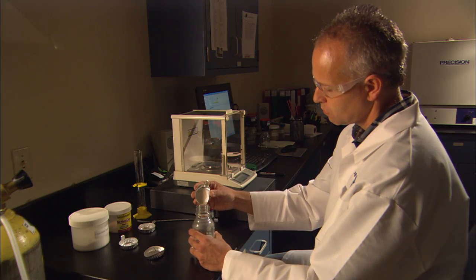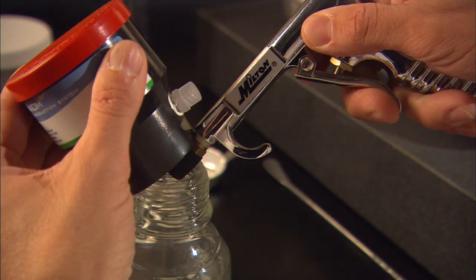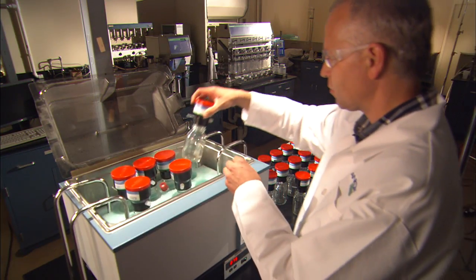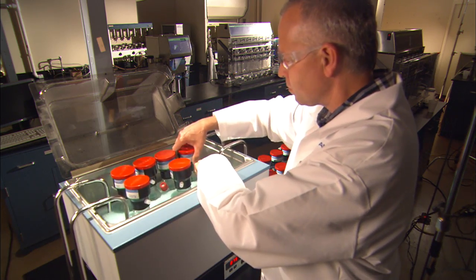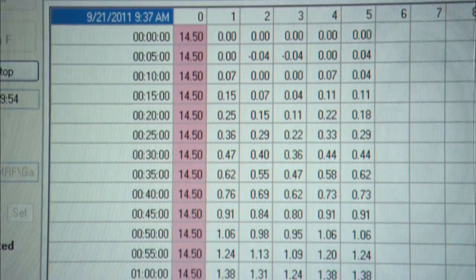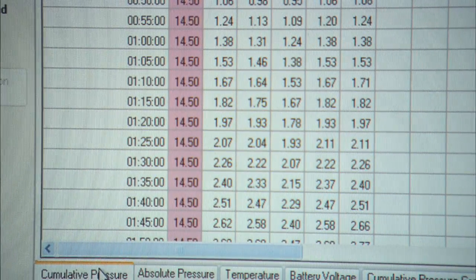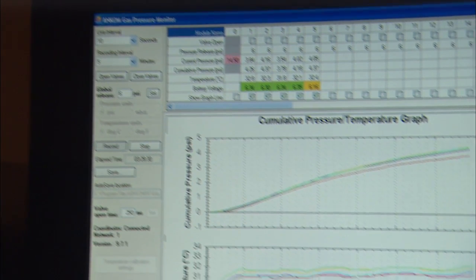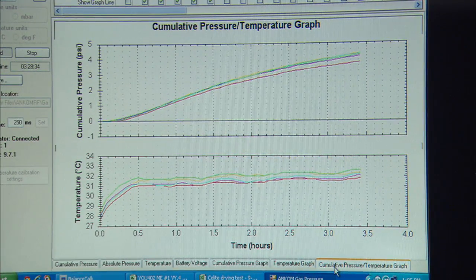Here's how the system works. Microbes, substrate, and buffer solutions are placed in the RF1 modules according to the requirements of the study involved. The modules are placed in an incubation source as needed. As gases evolve, the RF1 module measures the pressure and sends this information together with the temperature of the RF1 environment to the host computer using radiofrequency technology. The gas pressure monitor software stores the data while it automatically calculates and graphs cumulative pressure and temperature in real time.